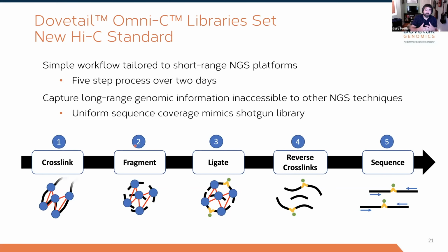So in a single sequencing run, you'll be able to capture all of these features, right? And so just to orient you to what Omni-C is, it's Hi-C at its core. We're not greatly altering that proximity-ligation workflow, that core workflow that I outlined at the beginning, with cross-linked cells, fragmentation, proximity-ligation, cross-link reversal, library generation, and sequencing. It's the same core workflow. But what we do is we don't use restriction enzymes. Here for our Omni-C protocol, we use DNase. And what DNase does for us is it gives us shotgun-like or whole genome-like coverage of the genome.